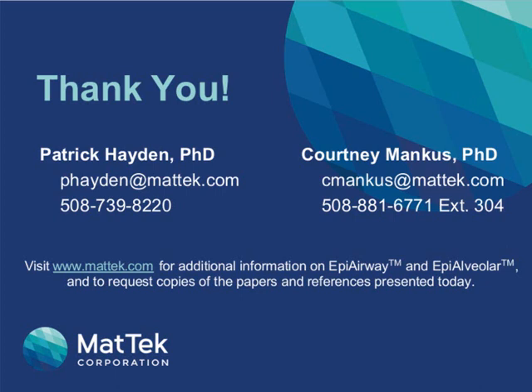As far as exposures, people have done this, but you need a special apparatus for cigarette smoke, or if you want to expose them to various aerosols, like diesel exhaust or some kind of drug aerosol. That can certainly be done, and I would again recommend to benchmark it against a known irritant formulation that's similar before you test your unknown.